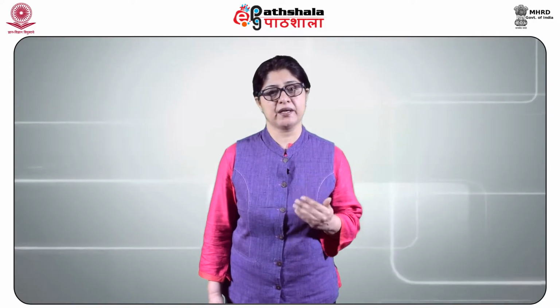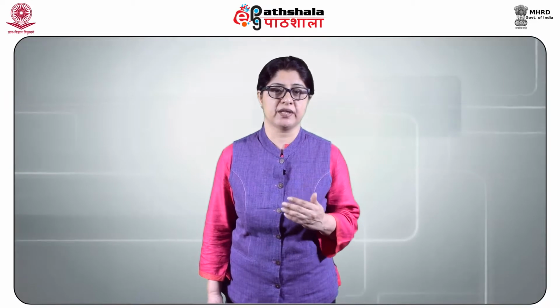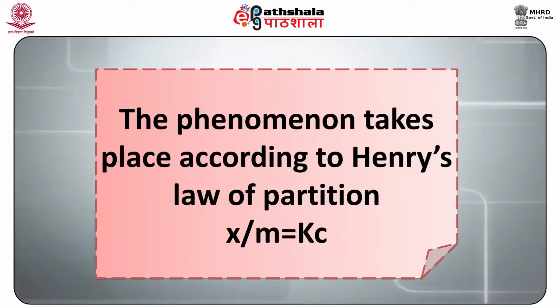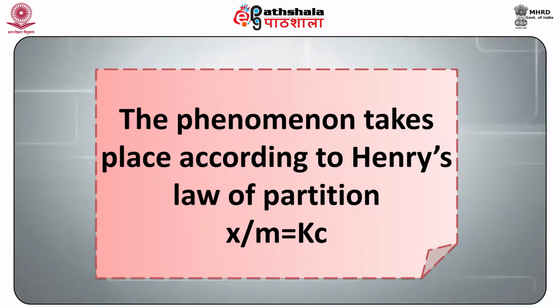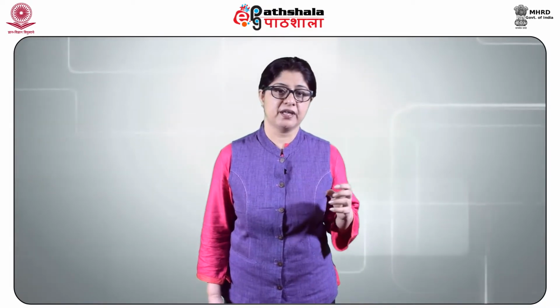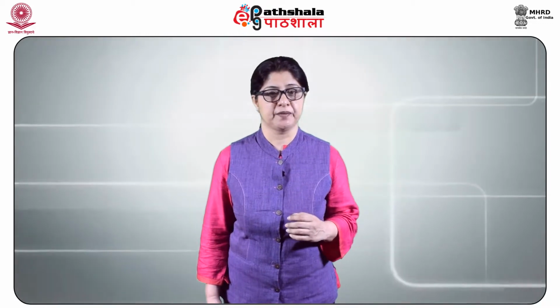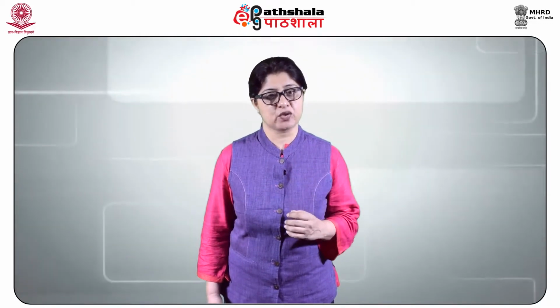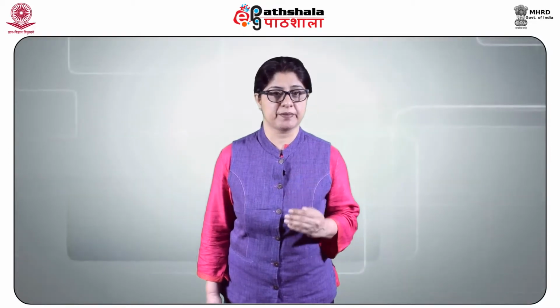Similarly, if the vapor or gas comes in contact with a liquid, a fixed quantity of the gas is dissolved in the liquid. The phenomenon takes place according to Henry's law of partition, that is x/m = kc. Both phenomena are selective, and there are different k values for different vapor-sorbent pairs. The principles of gas chromatography can be explained in terms of the following experiments.